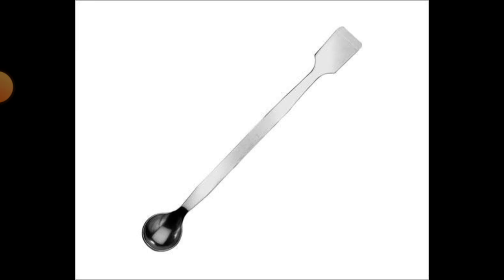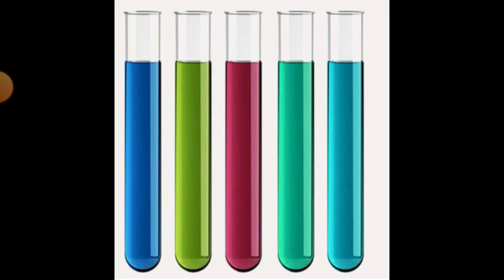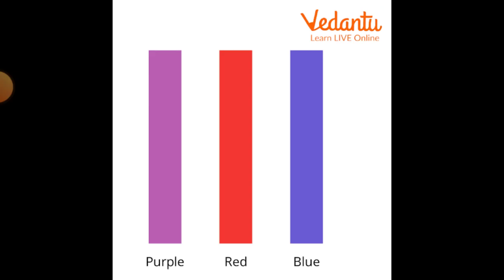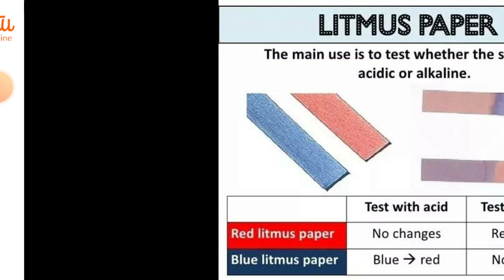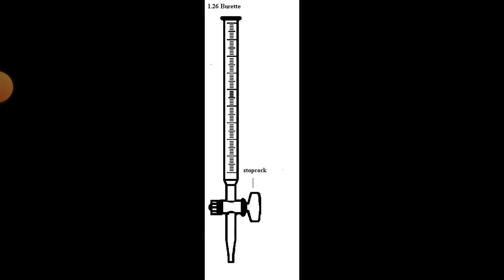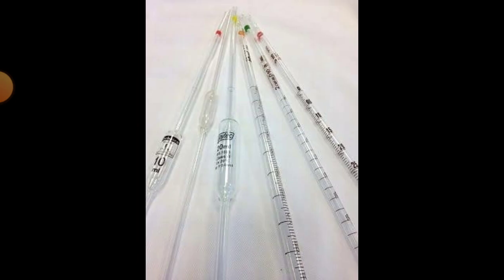Now, this is a spatula. A spatula is what you use to get basically acidic powders or for mixtures in the lab. So this is an example of a spatula. I'm showing you because I don't know the state of your school chemistry lab. Once you enter the NECO chemistry practical hall, you wouldn't be confused seeing these things.